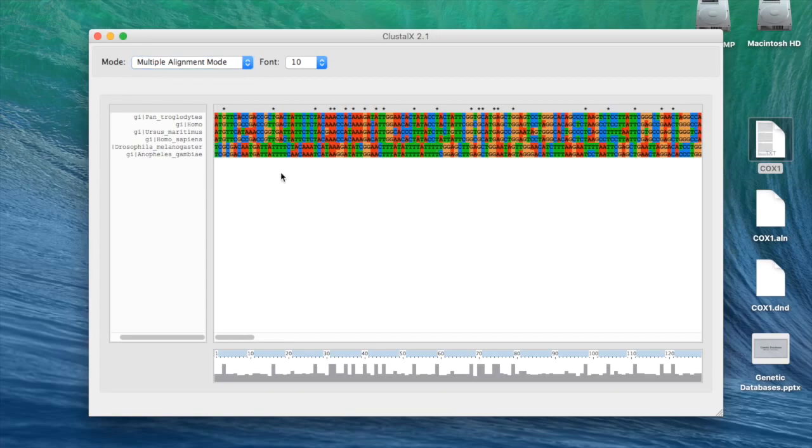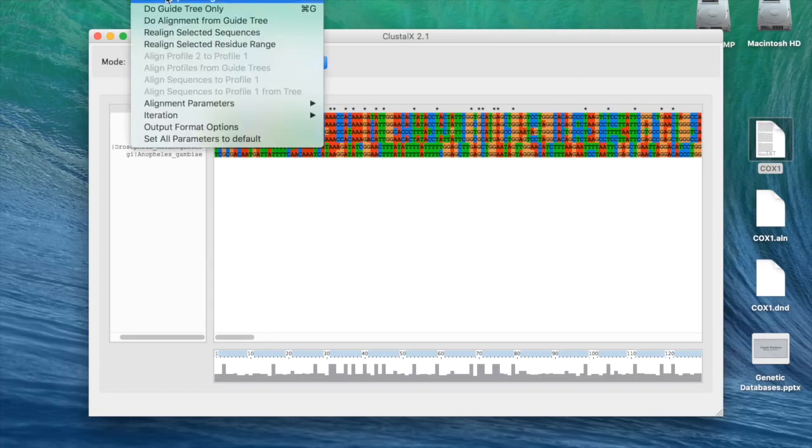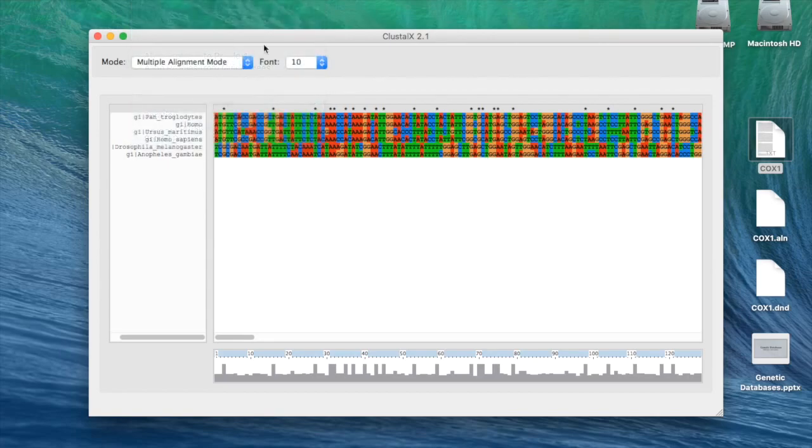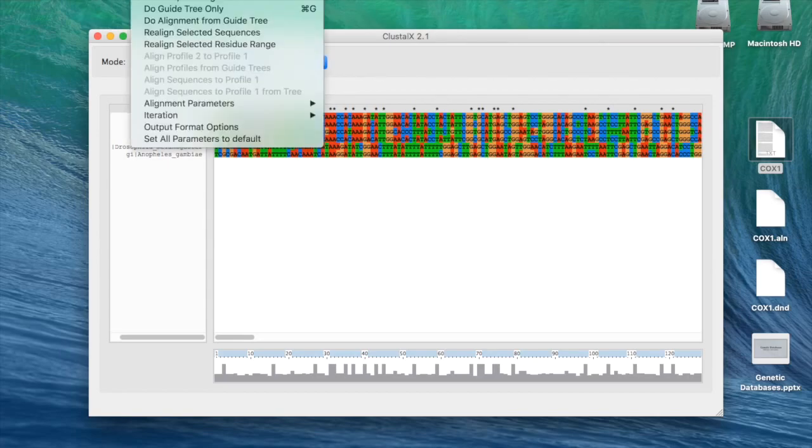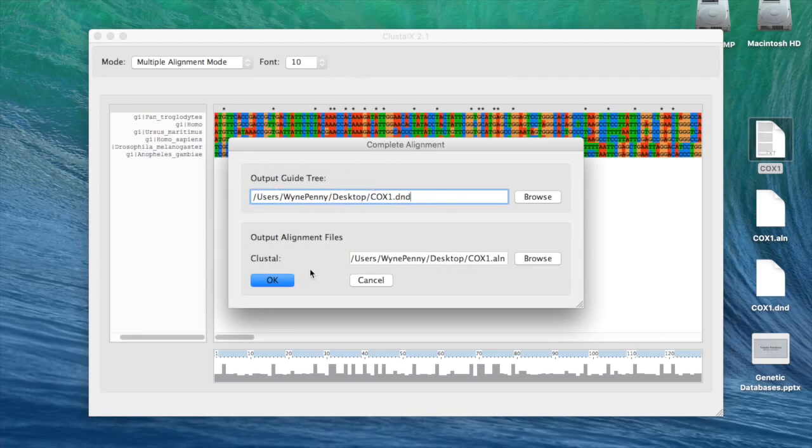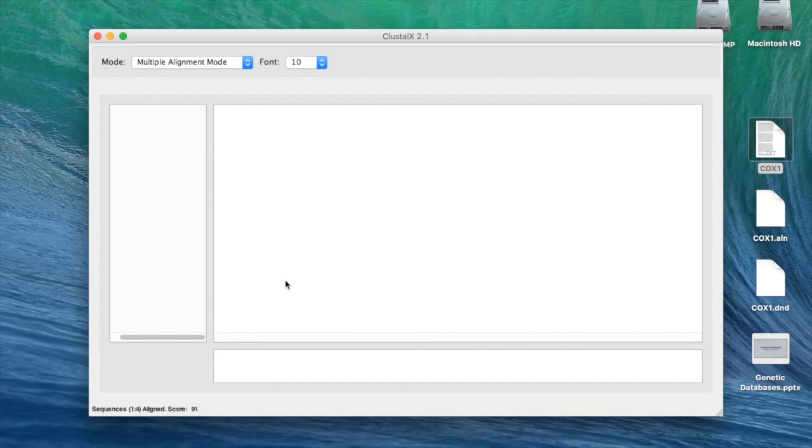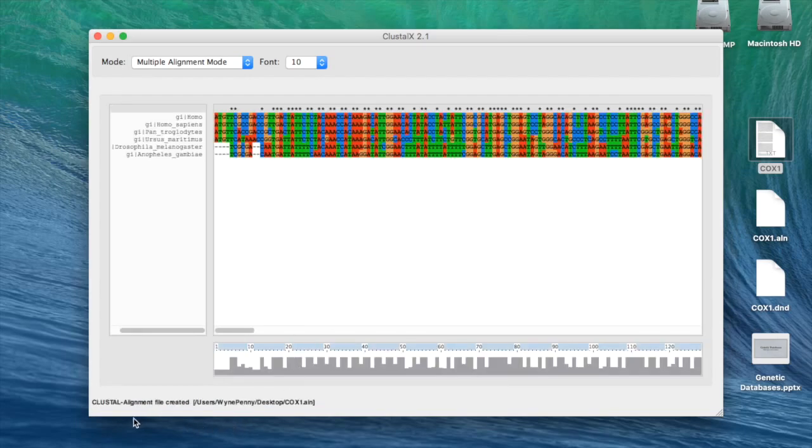But the last step is we actually need to align these sequences so the program can determine where the actual real differences are between the genes. If I go to Alignment, and then click, that's in the ClustalX menu, Alignment, and then click Do Complete Alignment. This will give me an output guide tree. This goes back to what I was saying about Topic 5. This file could be saved for use later in the syllabus when we actually come back to look at phylogenetic trees and evolutionary relationships. I'm going to press OK here to run the alignment. You can see it was working away there. And now this program, ClustalX, has aligned our sequences.